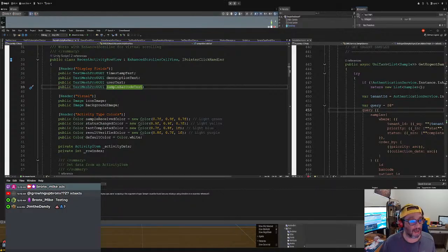All right, so we got that done. Now we're gonna make that into a prefab. Oh, okay, I know what I did wrong. All right, that's fine. I guess I'm getting tired. All right, so prefab, you unpack that completely, and we're gonna move this prefab up here first. There we go. Now we get the margins. Top. Yep. See, bottom. All right. So then we copy that component and paste it so we don't have to write it all the time.